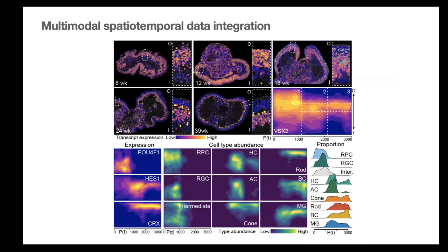However, some more stuff. Yeah, sorry. I told you that we had all these windows, and we also know the position of each nucleus in each of these windows. So we can visualize our mapped transcriptome, ATAC peaks, or just the cell types in this pseudotemporal space. You can see that certain cell types at the beginning are everywhere and then narrow down, or are not present anymore, finding the right place in the layers. So now we have a really integrated data set which we can also analyze along this trajectory.